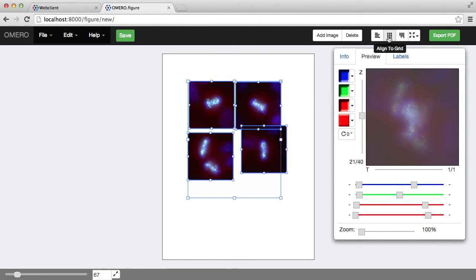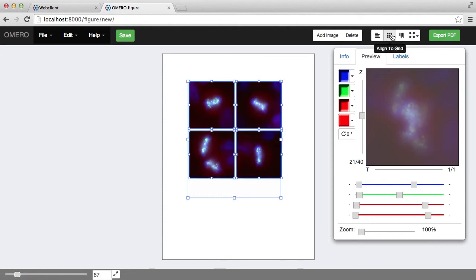Another useful feature here is the alignment to grid, which will put all the images into a grid with a small white space between them.